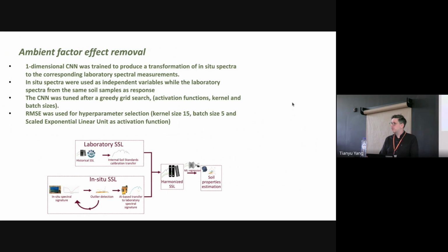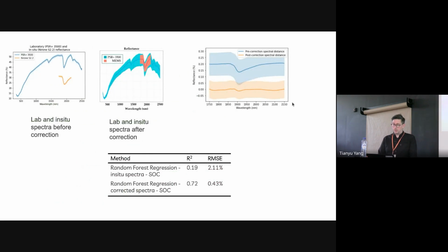And this is something that we also intend to do in the AI for Soil Health project. We are currently collecting spectra from different pilots. And this is how we are going to deal with it. And then, since the spectra were mapped back to the laboratory condition, we could also merge with different legacy spectral libraries. We applied also another harmonization technique that I do not want to extend now. It's out of the scope. But this helped us augment our data set and have very nice results in the modeling part.